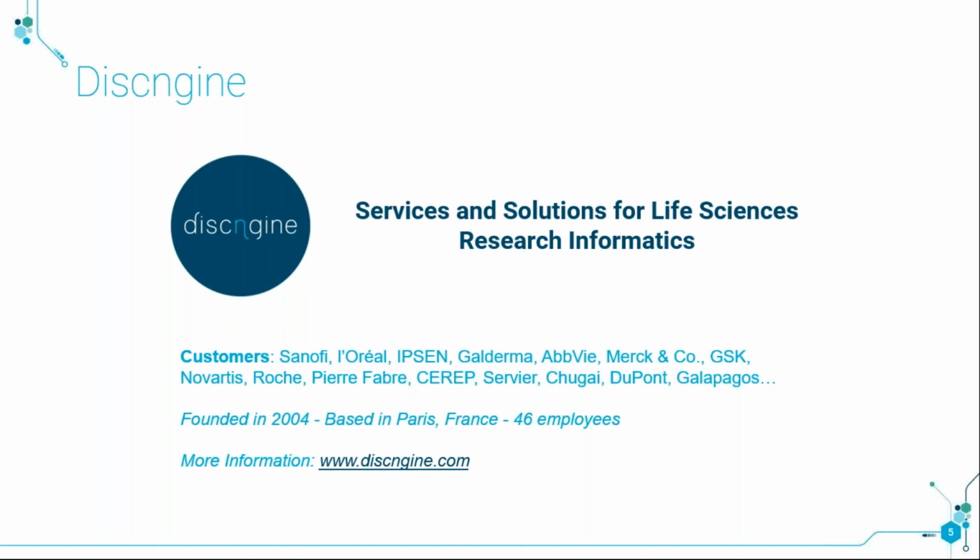So now let's get started by talking a bit about this new application called qualification. When I was in the lab, one of the recurrent questions that I asked myself was, how can I be sure that my pipetting operation is doing the right thing?